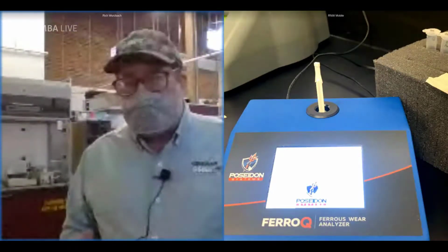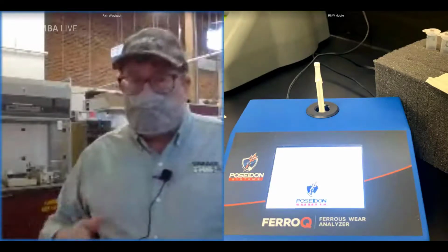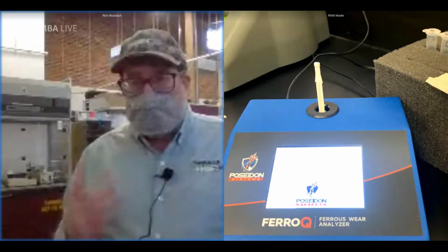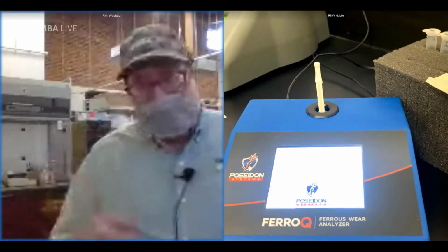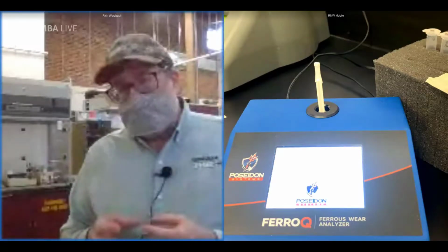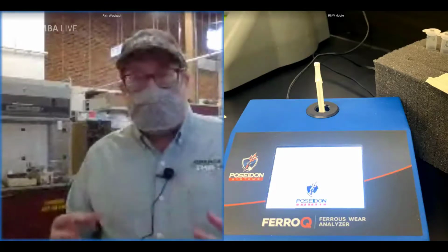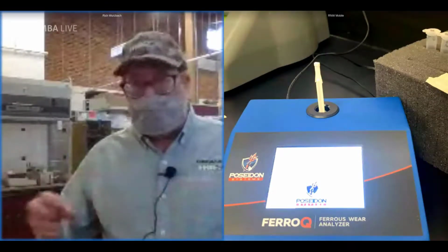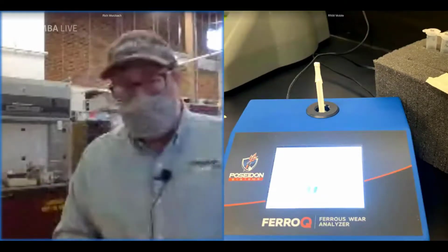And what was really exciting for us about that was we really put it through its paces. We really looked at the effect of heterogeneity and distribution of the particulates. So take the example where you take that grease sample, and you've got some ferrous content, but it's not evenly distributed over that sample. Well, we deliberately created this heterogeneous distribution where there was a whole lot of ferrous wear in one part or another part of the sample.